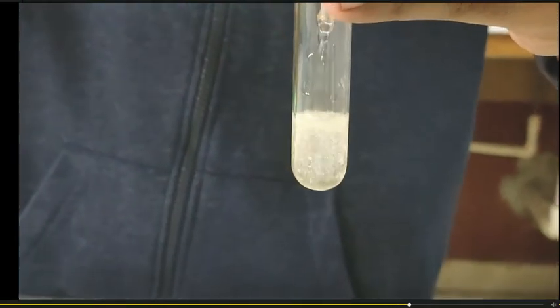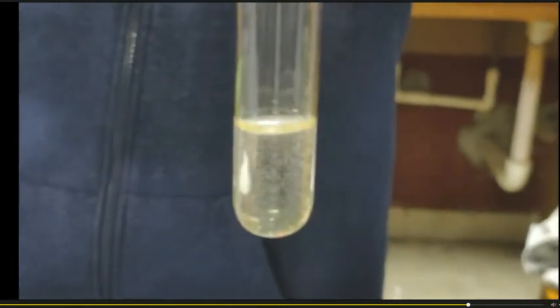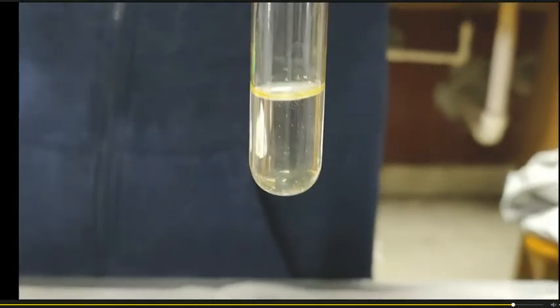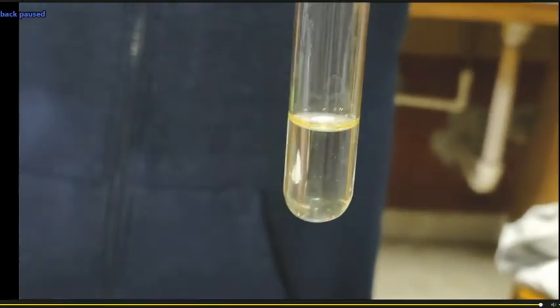The PPT is dissolving. The PPT is almost completely dissolved. This is all about calcium, and this indicates the presence of calcium cation. Hope you have understood how calcium is detected in the laboratory.